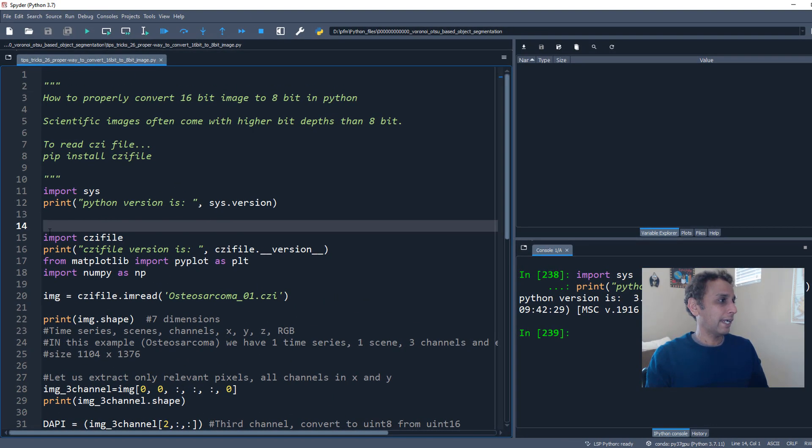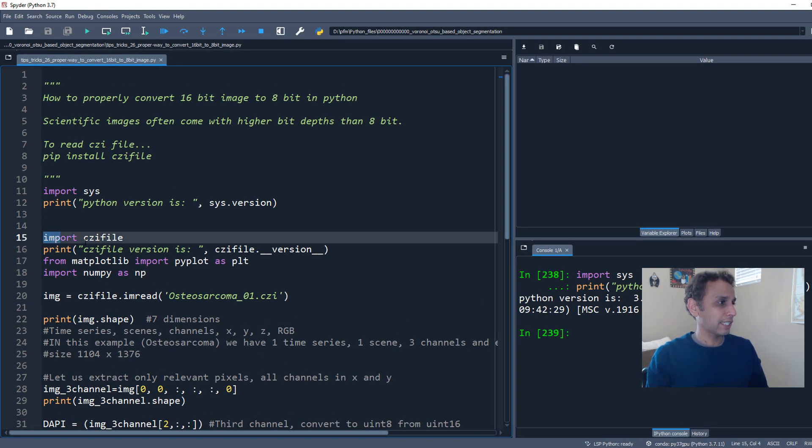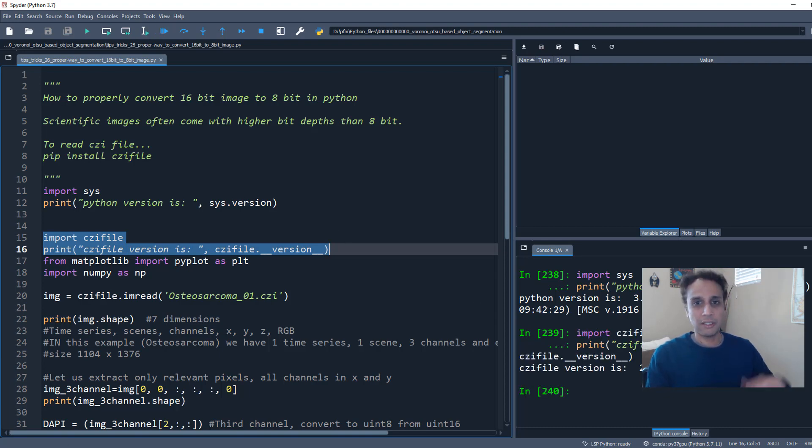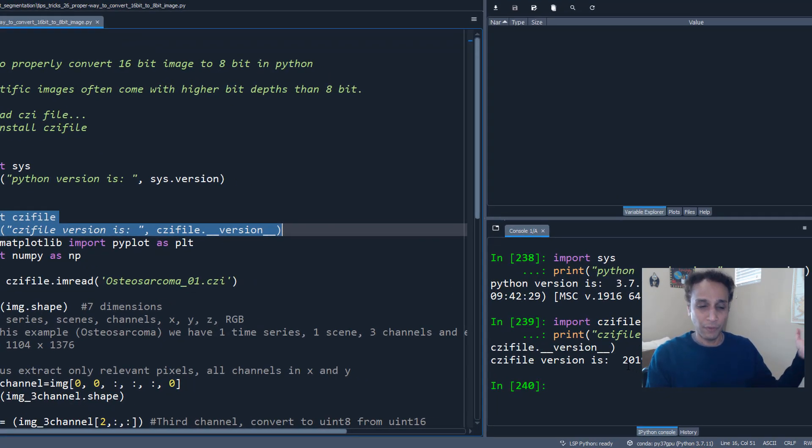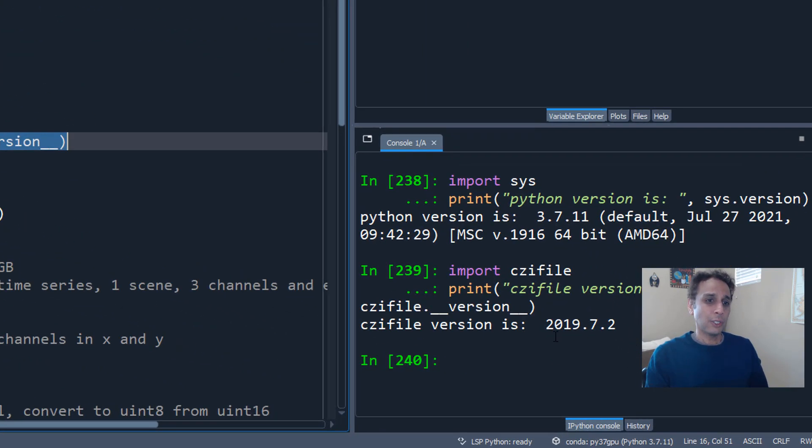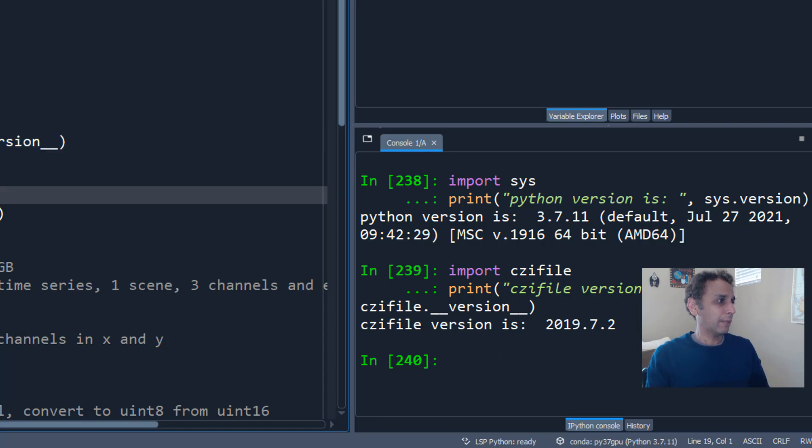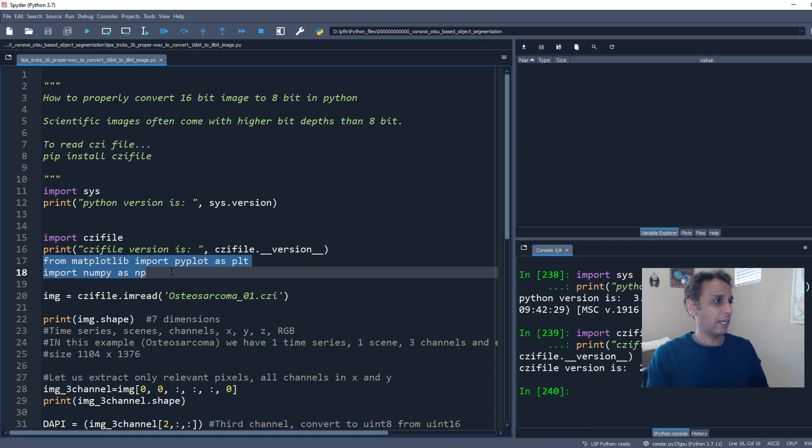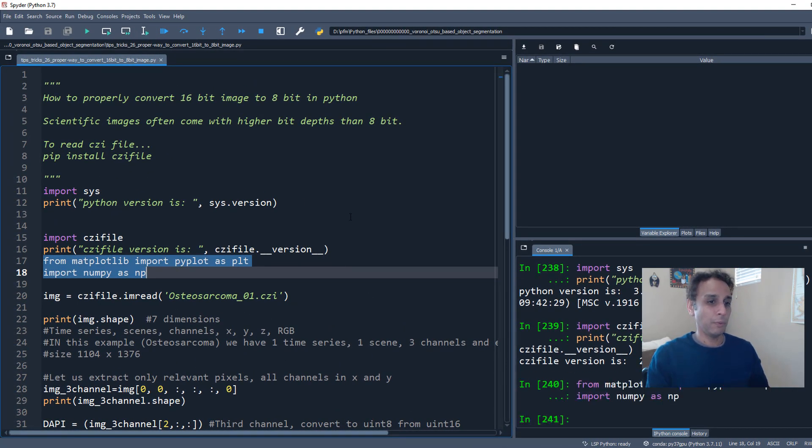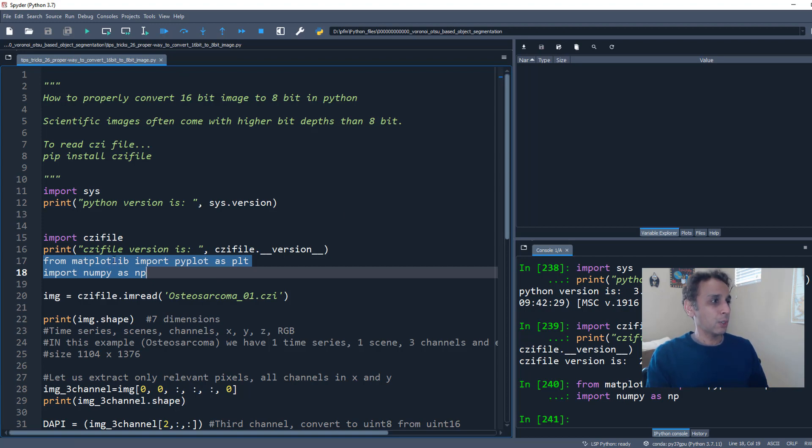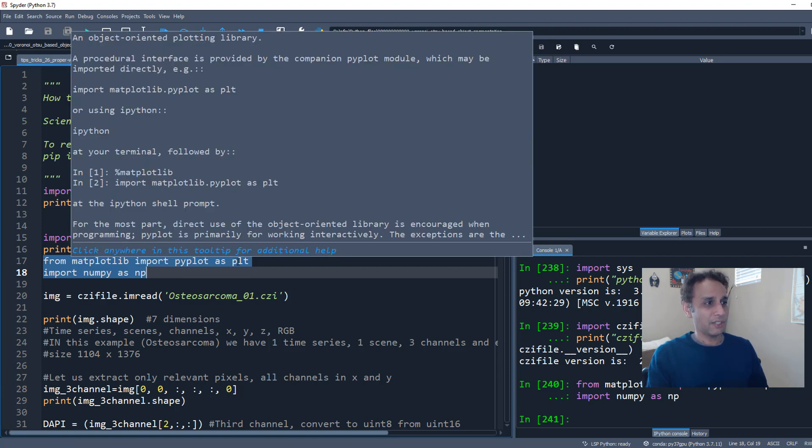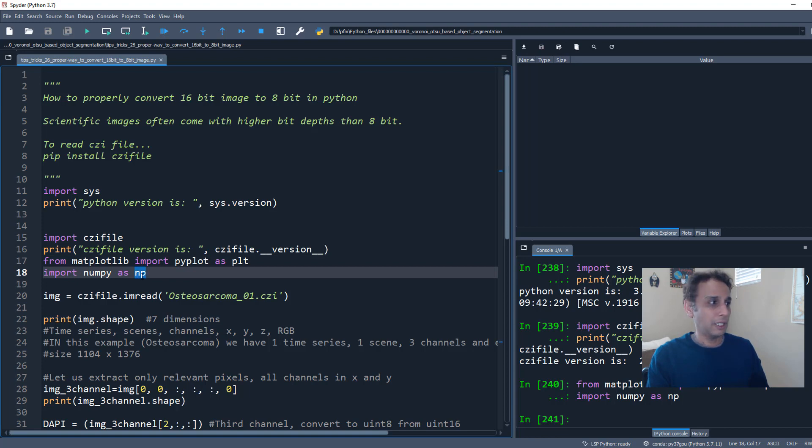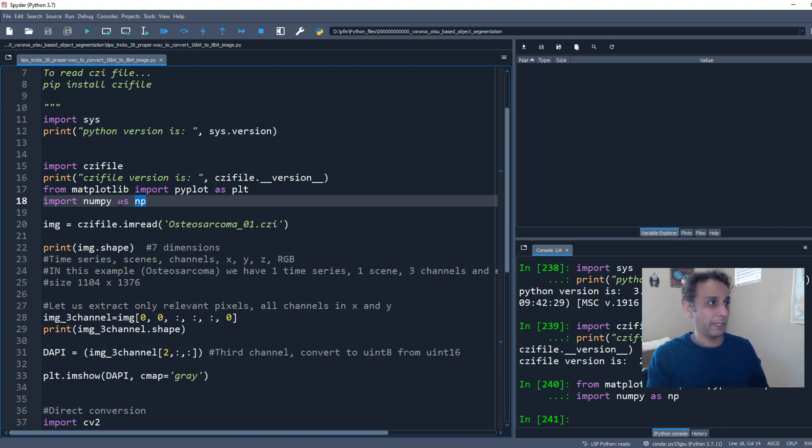Okay, now let's go ahead and import our CZI file. And I'm also going to print out the version in case you're watching this in future. So that's the version, 2019.7.2. And these two libraries are pretty stable for a long time. So no point in worrying about their versions at this point. So this is for plotting and that's, of course, NumPy to make sure we have the right library to work with the NumPy arrays, obviously NumPy.